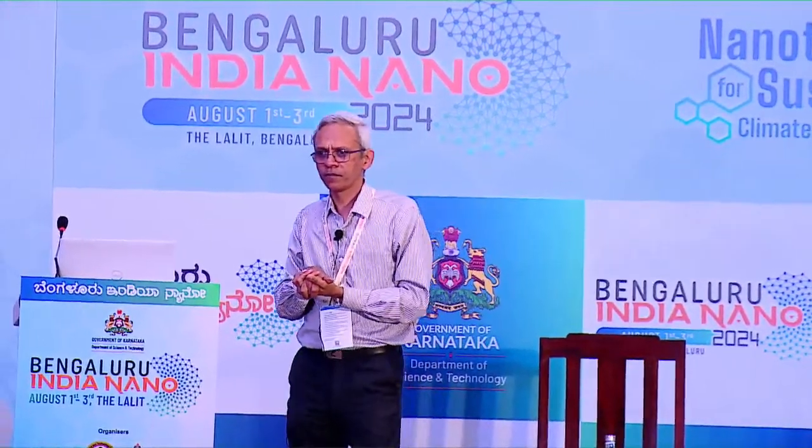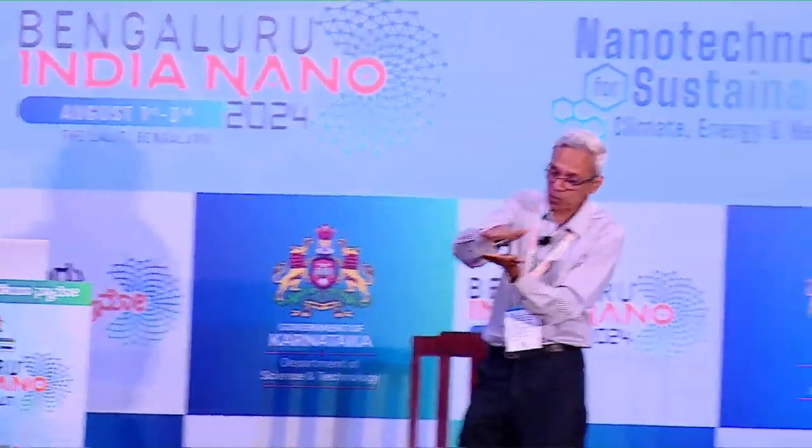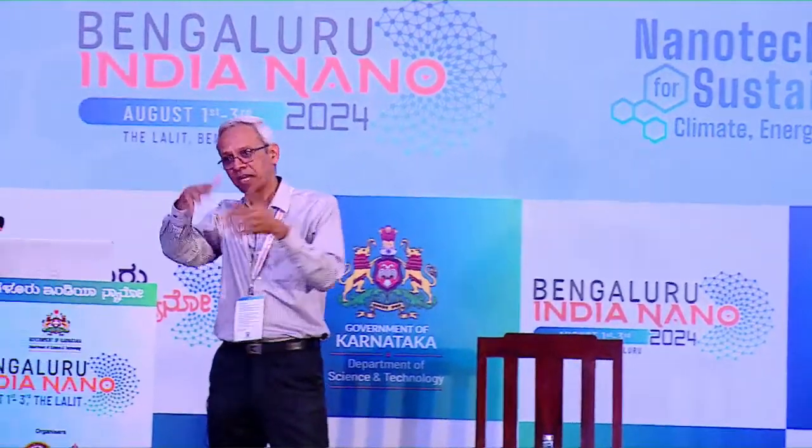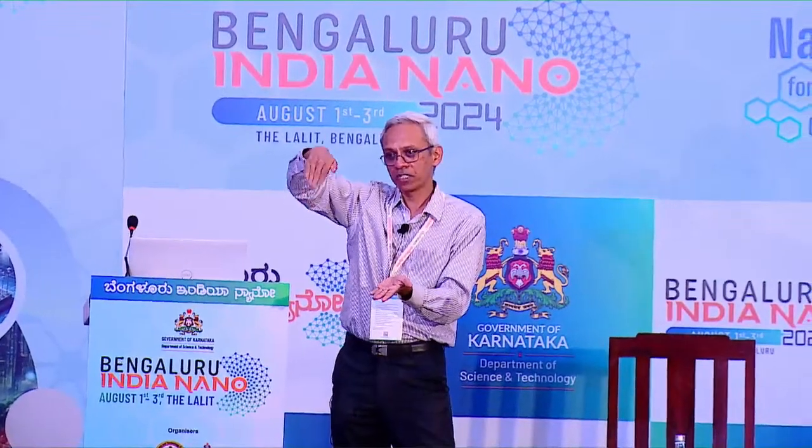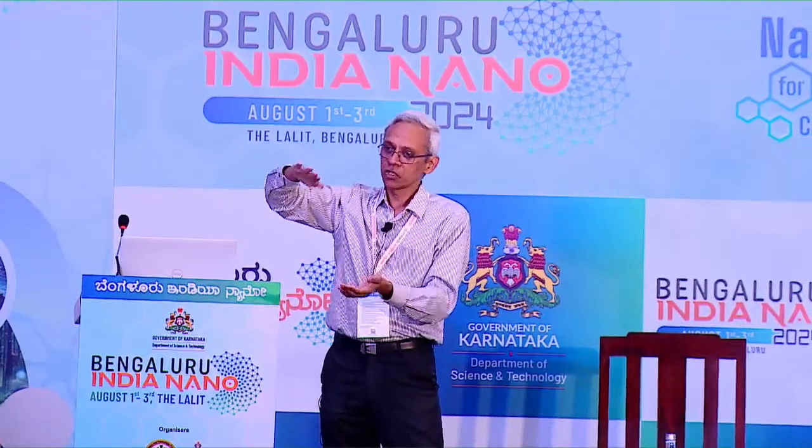Sometimes the crystallites will tend to orient to a particular direction. In that case, we can actually tilt. You're not only looking at one specific thing, we can actually tilt your specimen to orient it appropriately. Even for a polycrystalline material, normally when you put things inside the microscope, they're at random orientation. We can tilt it along the axis, or this way, both two axes of tilt are available, so that you can orient it along a certain crystallographic direction. That can be done.